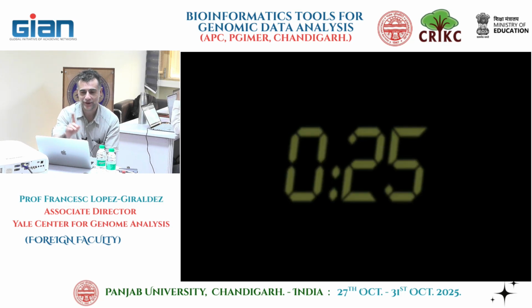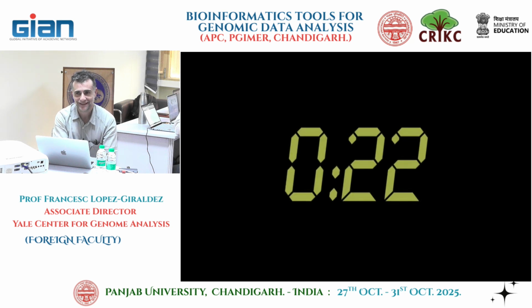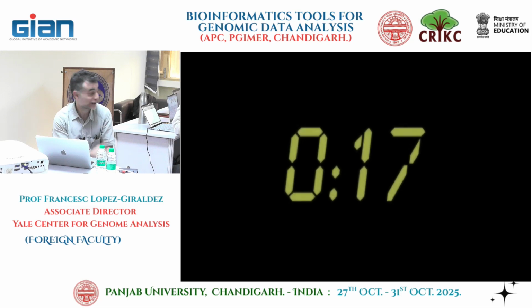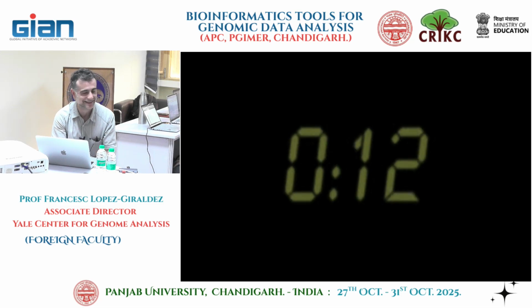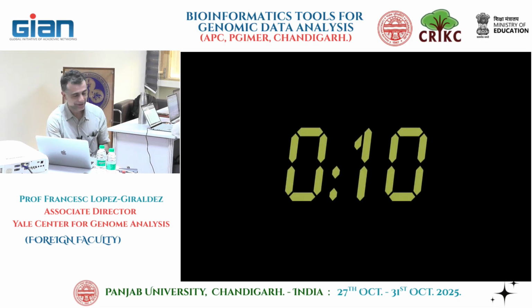Okay, you already figured out one? Okay, hold on your thought. Cluster 1 is CD8. Okay. I don't know the answer, so I don't have the right answer. So we're going to try our best. Cluster 1 is CD8. Okay, hold on.